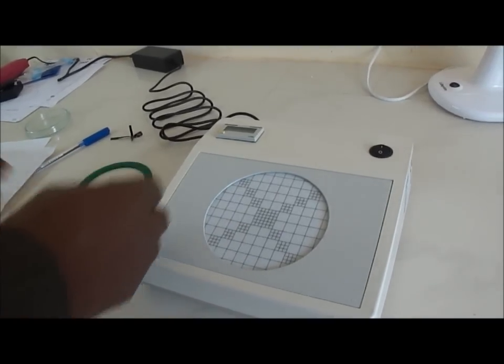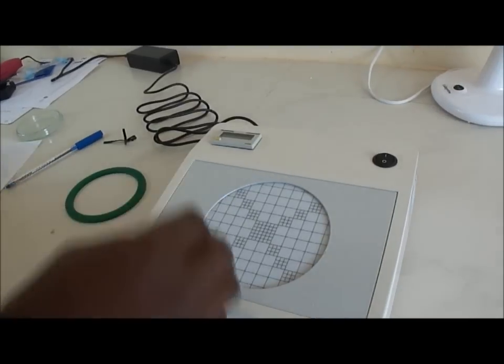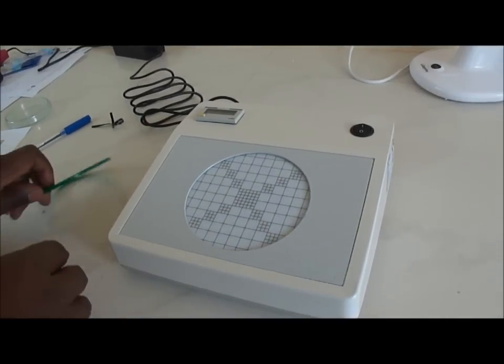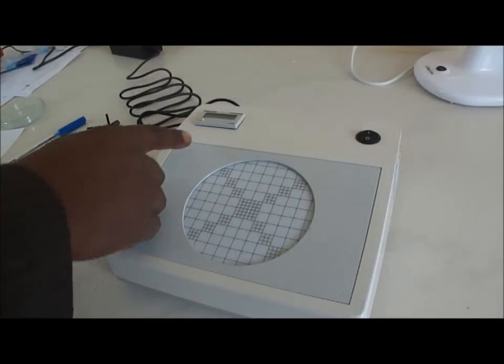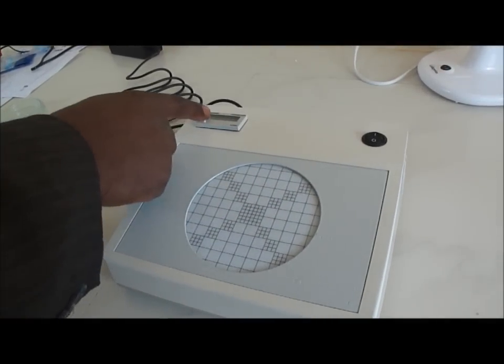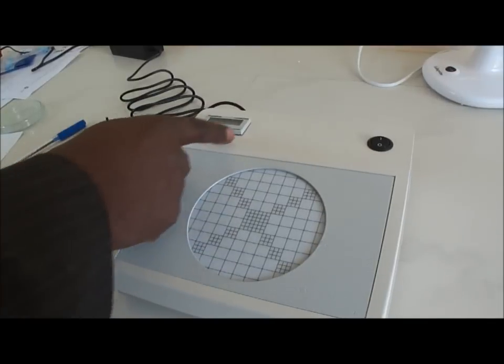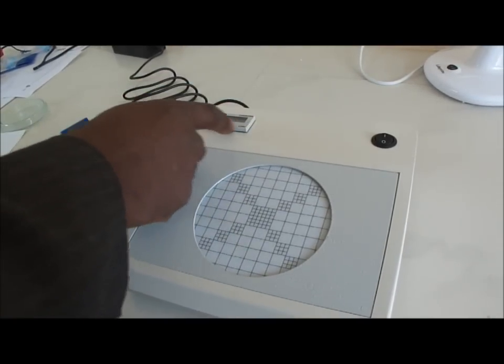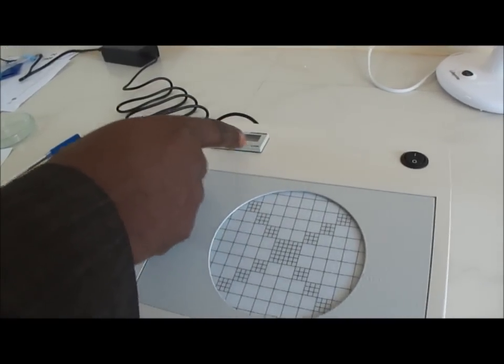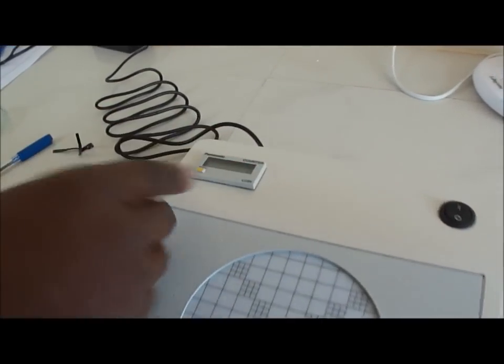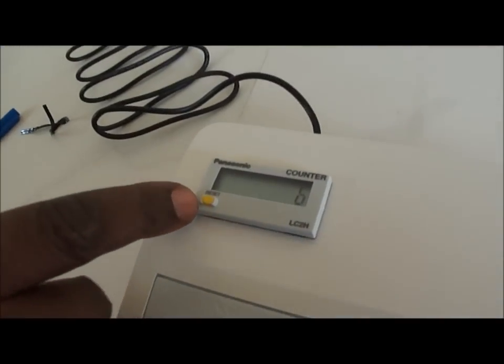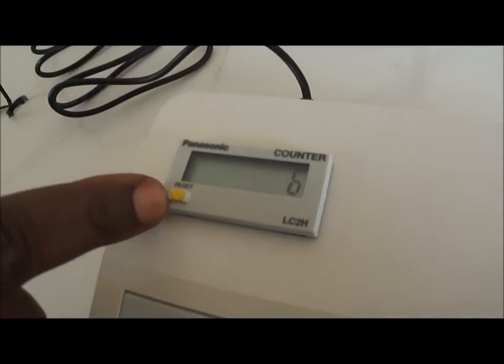Now if you look at the device itself, it's very simple, you have here first a counter with a liquid crystal display, and you have a reset, a small reset button.